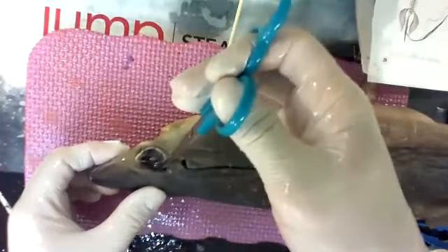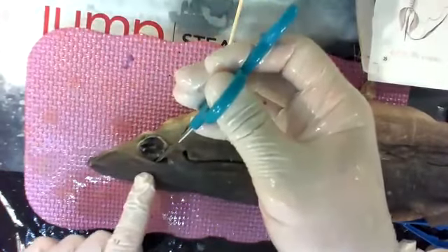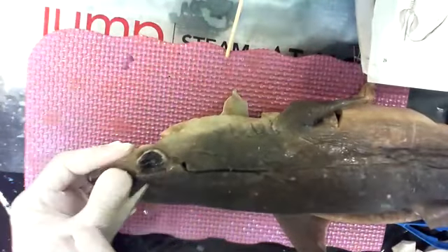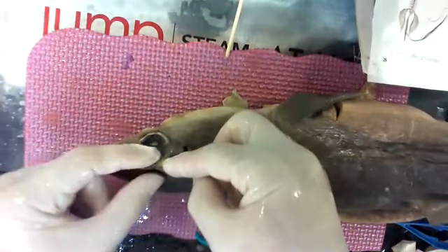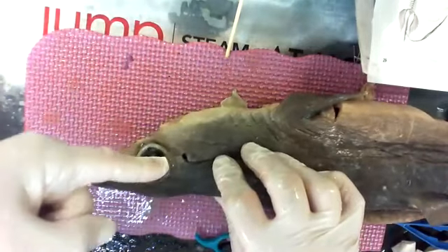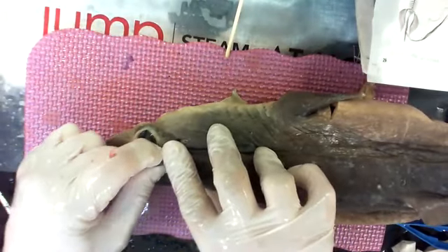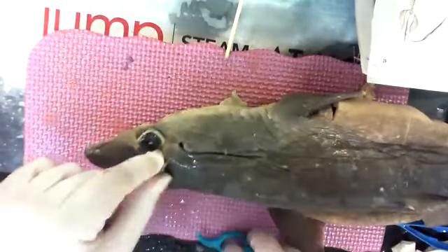And I'm going to do the same thing at the front. I'm going above the eye. You can see all those little pores of Lorenzini. It's kind of cool. Sorry, ampullae of Lorenzini. They're little pores for electricity. I just pull back. So now I have the tissue above the eye. I can put my finger in here and I can actually feel the eye socket, the shape, the roundness. And this is how weak it is. If I pull back, I just broke it. So that was part of the skull that I just broke.